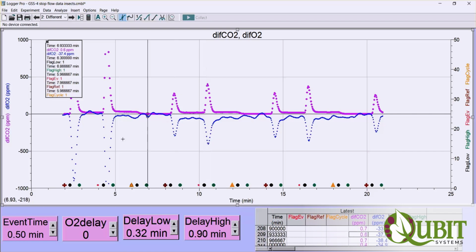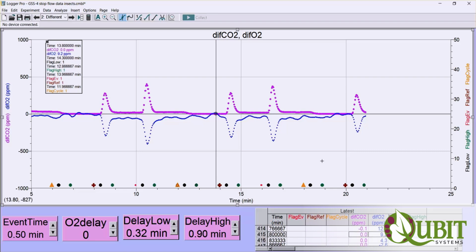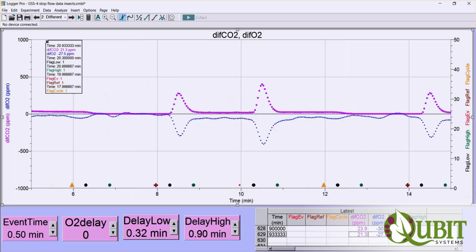It helps to zoom into your data, so I'm going to do that right now. So just select your maximum and minimum on the x-axis so we can see one cycle clearly and a couple of peaks clearly. And now when you bring your examine line, you can see that the oxygen dip is about 1 point behind the CO2.